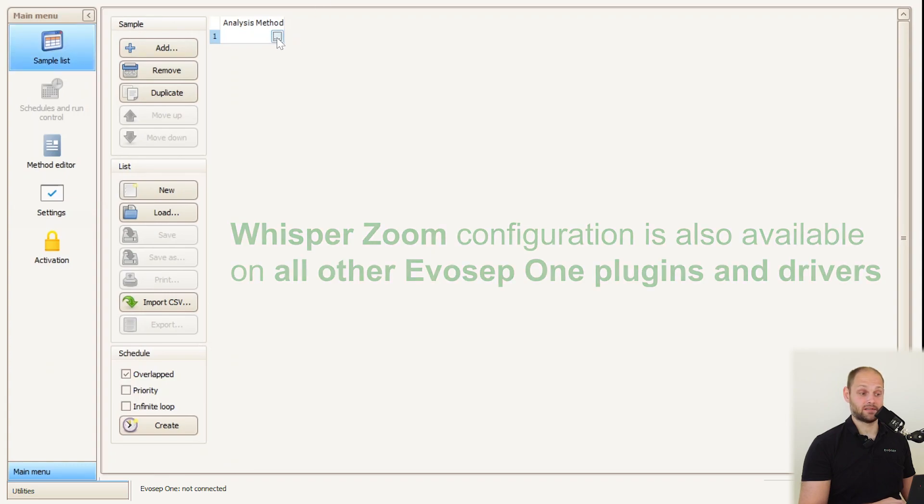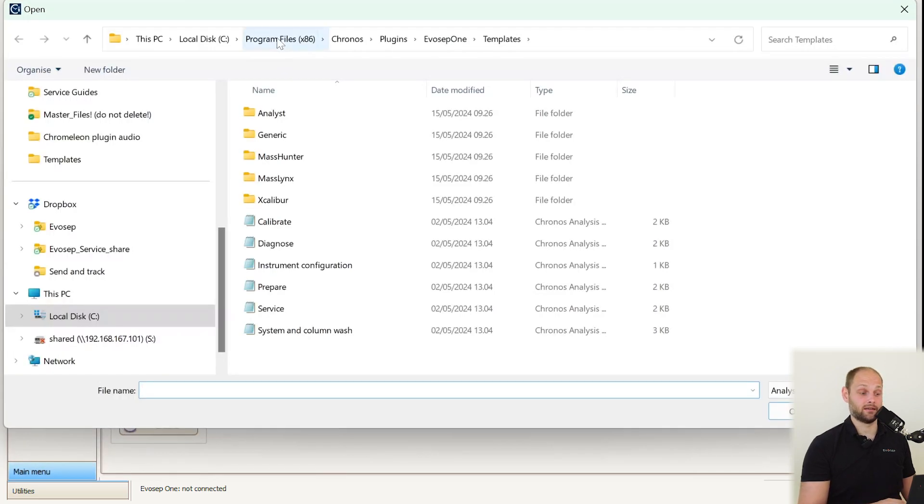Within this tab we can select methods, and the method we're interested in is the instrument configuration method. This method allows us to check the current configuration of the system but also allows us to change it to the zoom configuration.